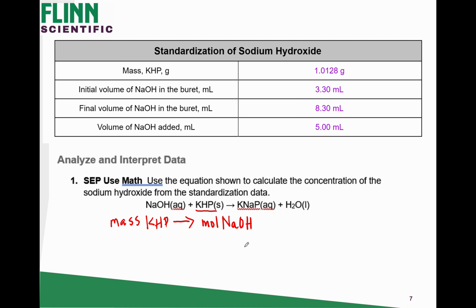Now, why is it important to go to moles of the sodium hydroxide? Well, don't forget, you're looking for concentration. And what's our formula for concentration? Moles over liter. Now, you have your volume information right there. Don't forget, you need to convert your mL to liters.